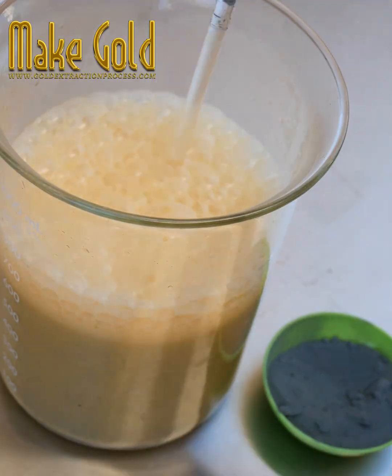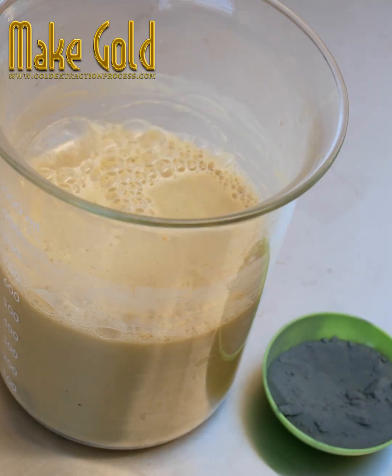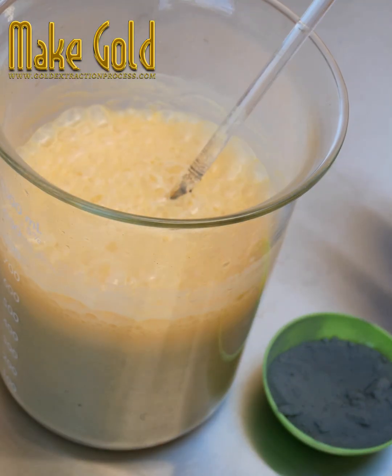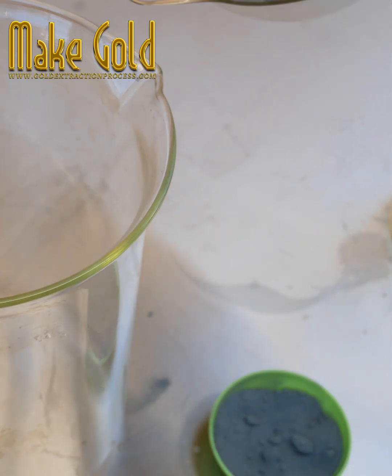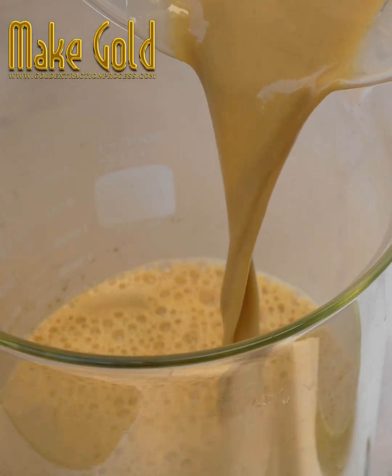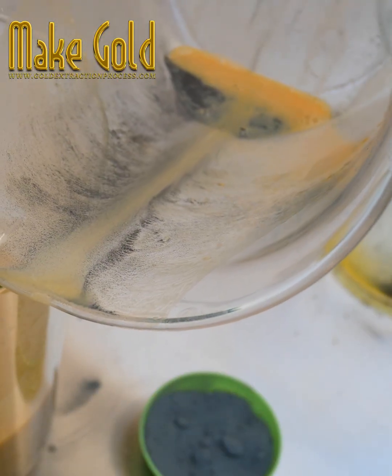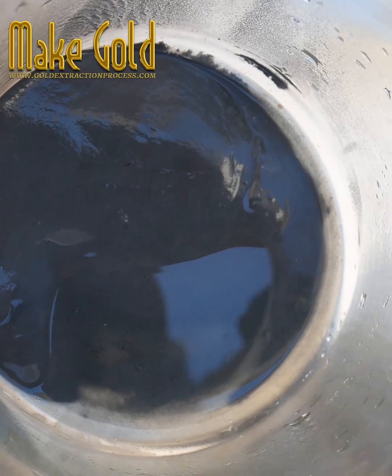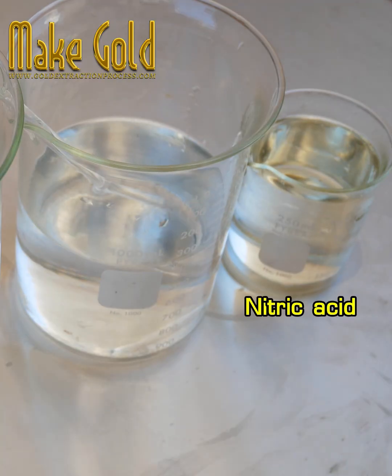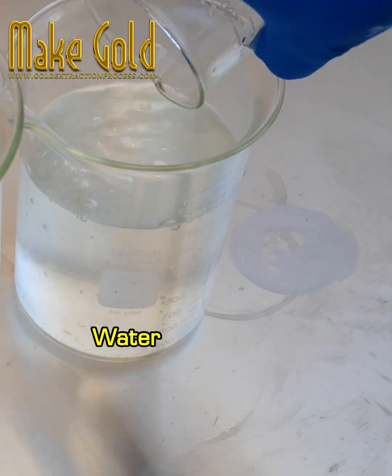Rinse and clean with hot water three times. When you have finished stripping the gold, you will have enough gold powder. Once dry, you can forge gold at 90 to 95 percent purity. If you want 24-carat pure gold, use aqua regia to dissolve the gold further.